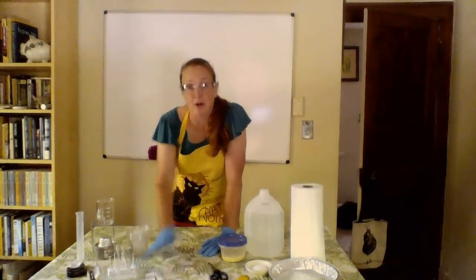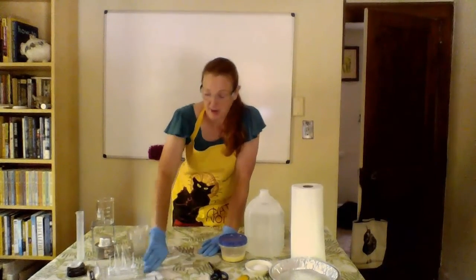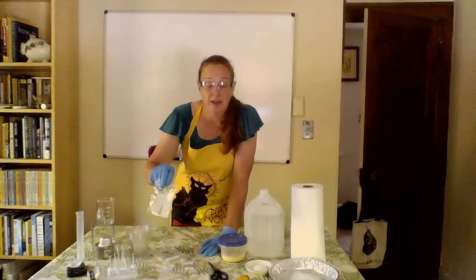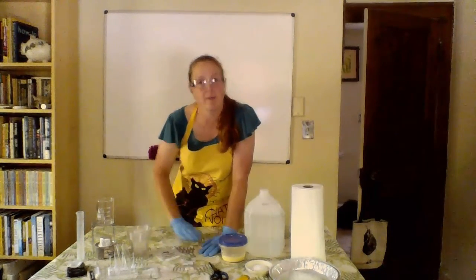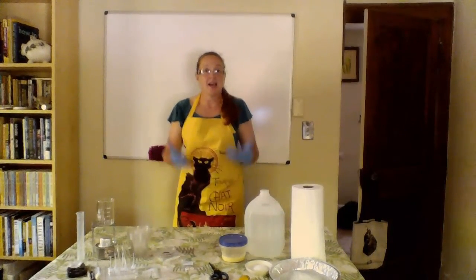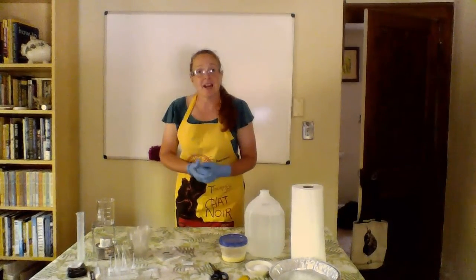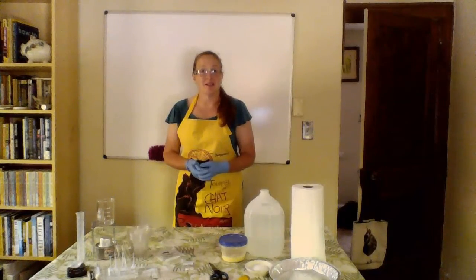We're going to be using the well plate in order to hold our test tubes, so we don't need our test tube rack. And then don't forget to find these little glucose strips, and we'll talk about those in a little bit when we get into the experiment. So hopefully today's experiment is interesting and is applicable, and you understand how it applies to our digestive system.